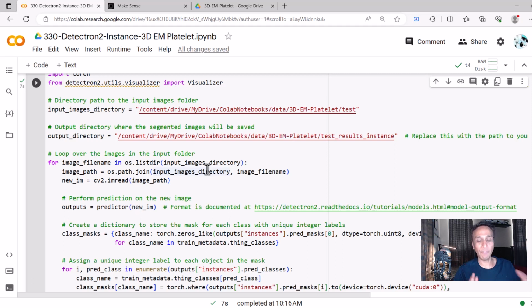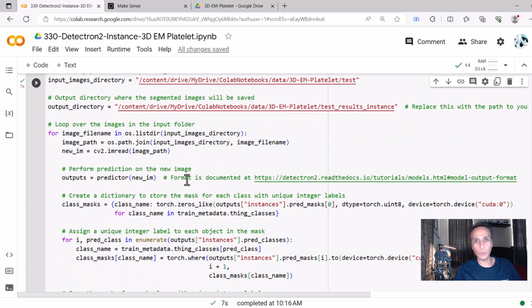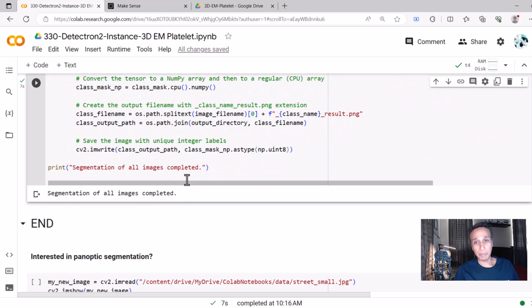The whole point here is not just putting a fancy bounding box and showing color images. You're doing scientific images, which means you are always after some sort of quantitative information, and that's exactly what you can get, whether it is in the CSV file captured as object measurements, or by exporting them for further downstream analysis. Maybe you want to do some sort of neighborhood analysis. Maybe you want to segment this image, but within each of the segmented images, find how many mitochondria are there and what the average size distribution is. Whatever you want to do downstream, you should be able to do that.